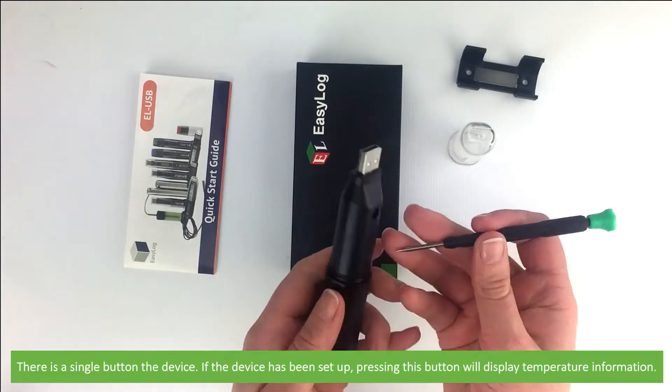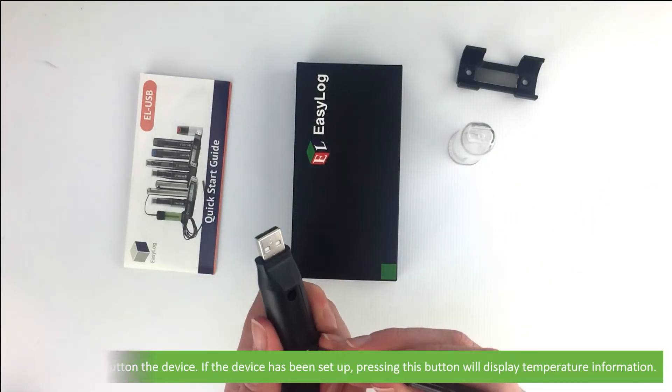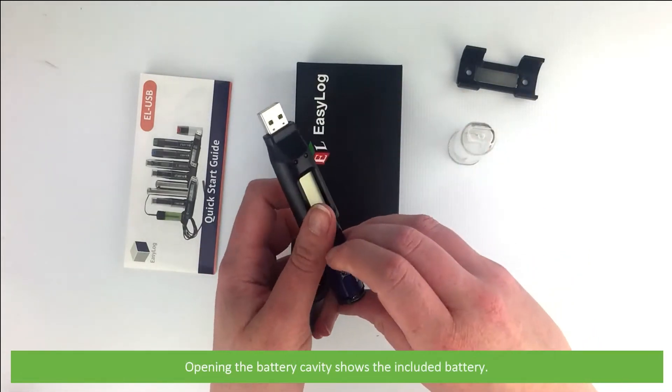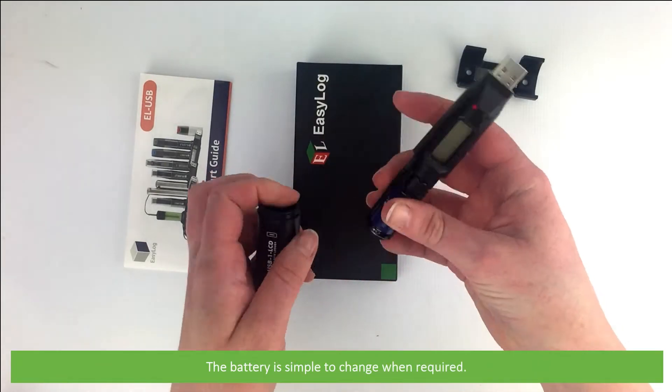If the device has been set up using the easy log software, pressing the button will display temperature information. Opening the battery cavity shows the included battery, which is simple to change when required.